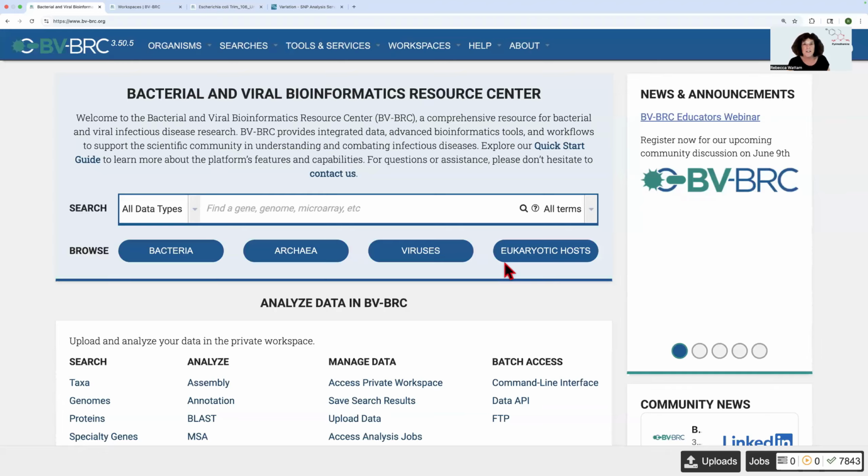Remember that variation job we just submitted? We used 3 different run numbers, comparing them to a genome that I had assembled and annotated in BV-BRC that was a part of the same experiment. Well, we're going to look at those job results now.